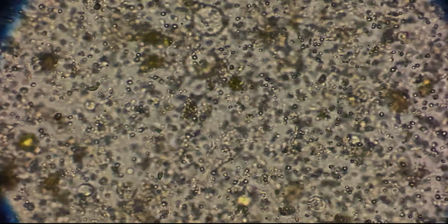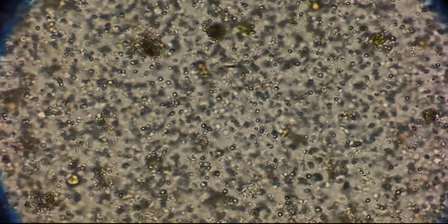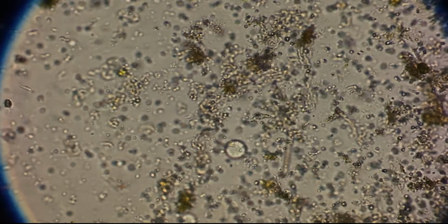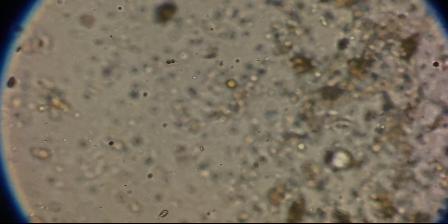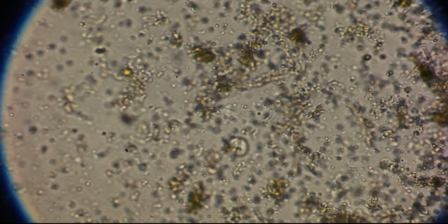Let's find out. Here comes the drop, and there it is. The juice is spreading across the slide. Watch the edge of that liquid right now. Watch closely. Wait, did you see that? Something near the edge just froze mid-swim. Let's zoom in. Okay, this is fascinating.